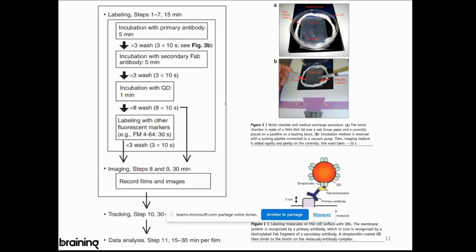All right, so a typical experiment takes, as you can see here, around an hour. So what do we do? We first, of course, label the cells, because this is an immunocytochemistry experiment. We are using, as I mentioned, these glass coverslips on which the cells are coated and have grown.